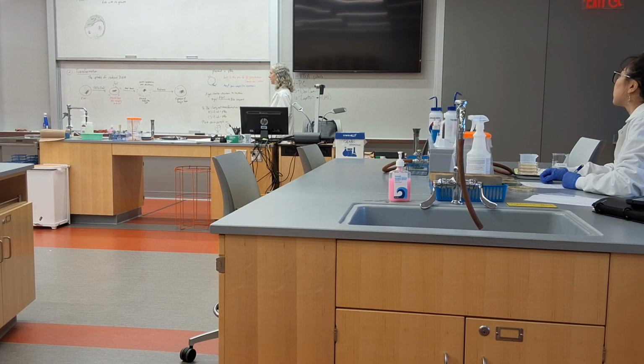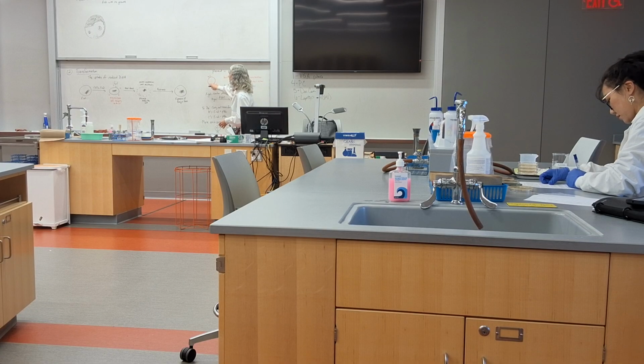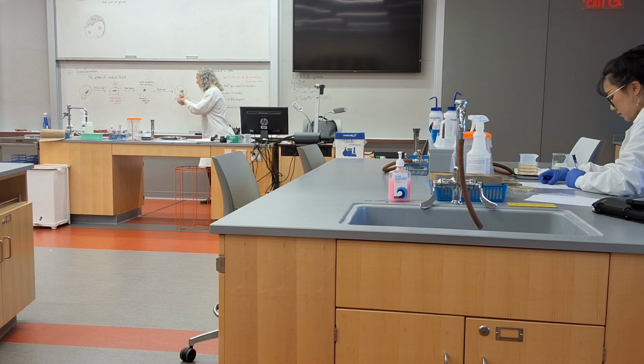Now, in order for us to see whether or not this is successful, the plasmid we're using is called pBlue. So usually when you have a name for a plasmid, you have a lowercase p for plasmid, and then some kind of representation of what that plasmid is offering. This one is offering the ability to produce a blue compound, so that your colonies are actually blue. Okay. Now, in this plasmid, there are two key genes. One is an ampicillin resistance gene. So any bacteria that takes up this plasmid should be resistant to ampicillin.